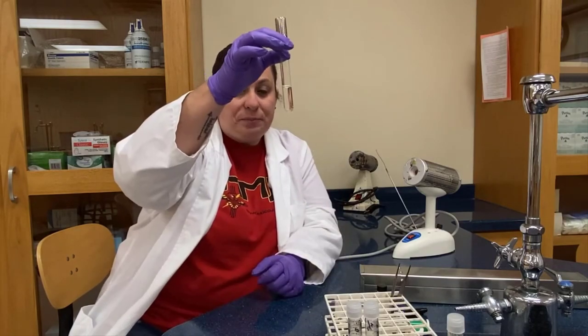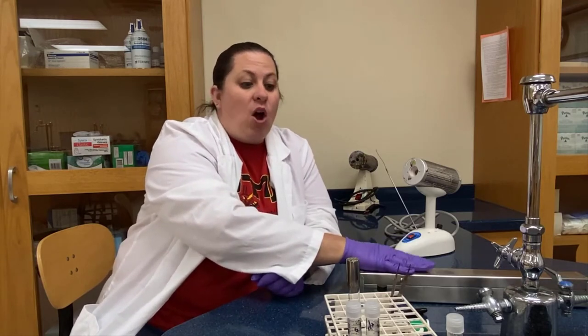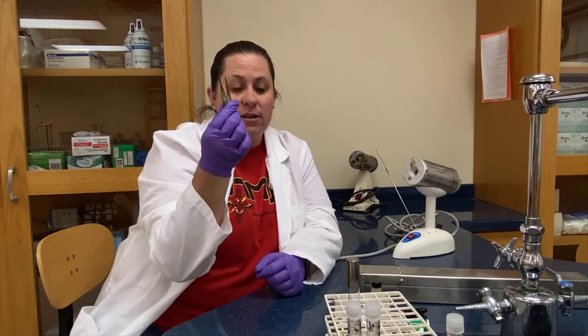Let's talk about aseptic transfers. We're going to do an aseptic transfer first with sterile water using a pipette. We're also going to do an aseptic transfer of a paper disc, and for that we're going to utilize our forceps.